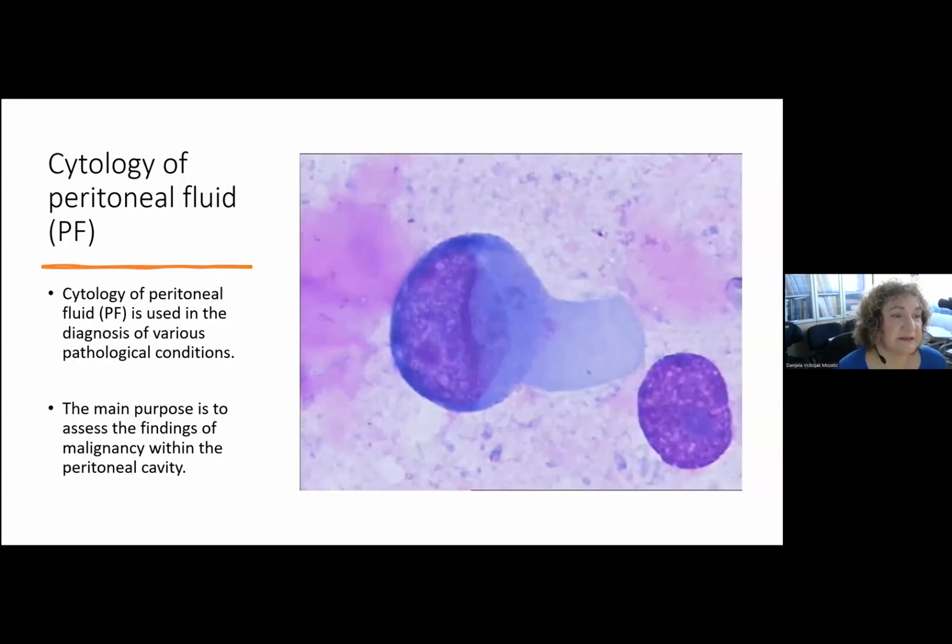So, cytology of the peritoneal fluid specifically is used in the diagnosis of various pathological conditions, but the main purpose is to assess the findings of malignancy within the peritoneal cavity.